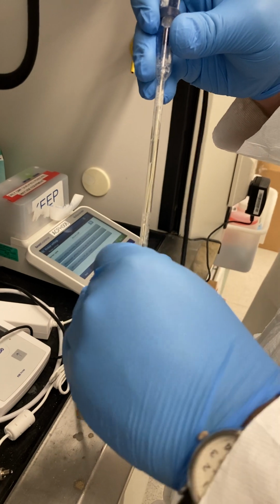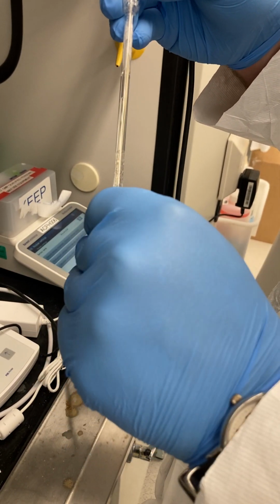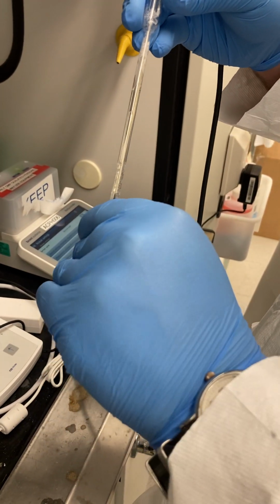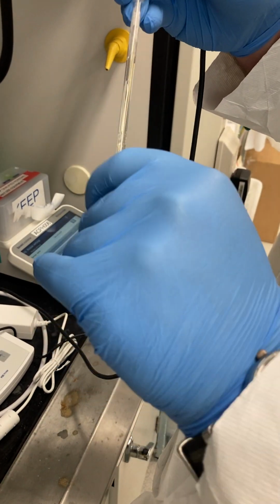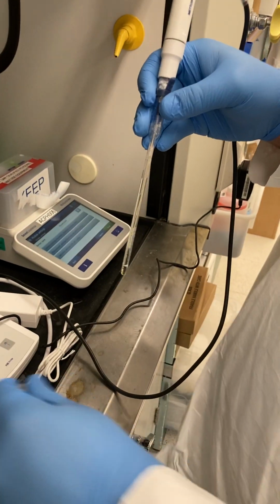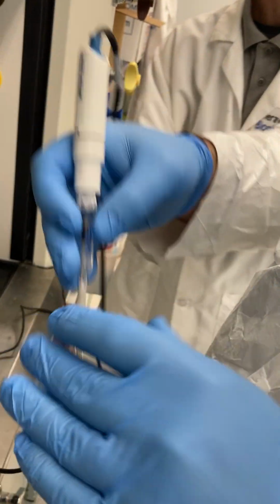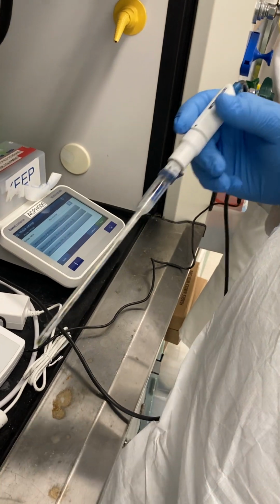And Jack actually said that he doesn't care if this probe doesn't get used. Gotcha. If we need to, we can take the probe from the other meter and put it on this one. Okay. Yeah, this probe should be used.